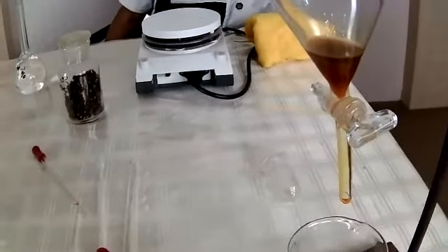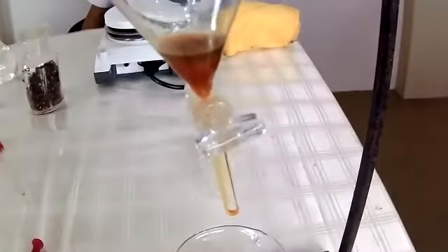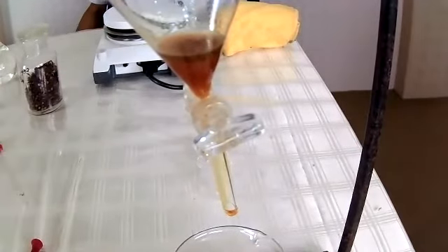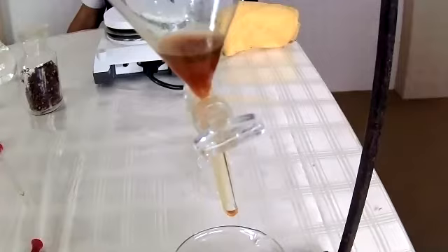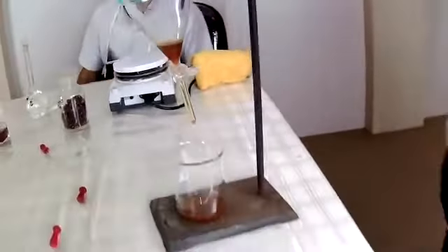You can see the separation there. There are two layers, the dark brown and the light brown. The top part is the caryophyllene, and the other part is the sodium eugenolate.